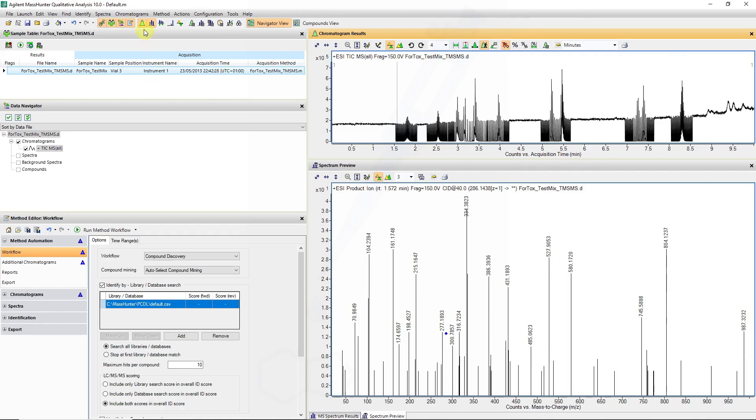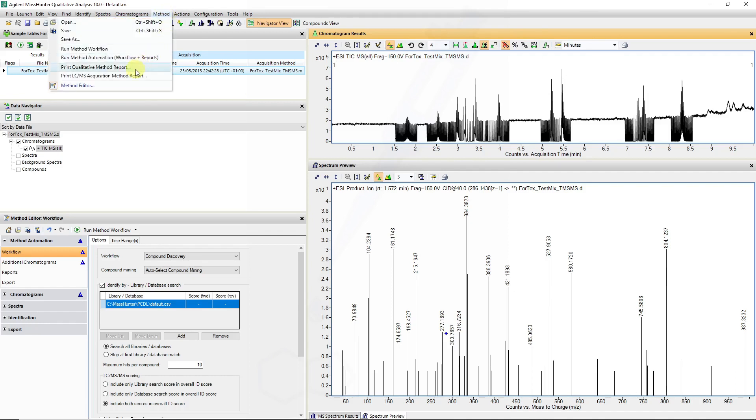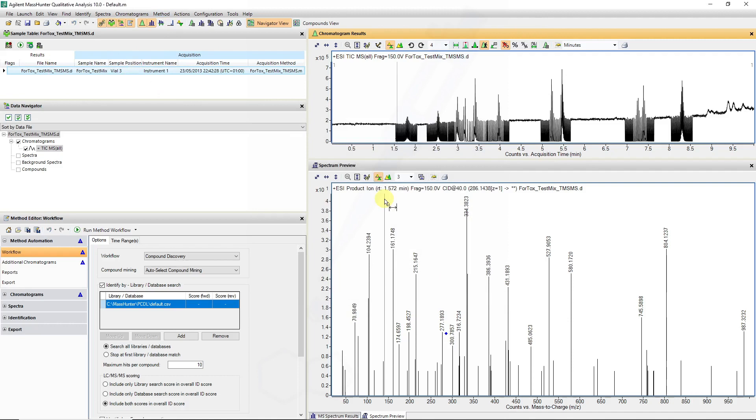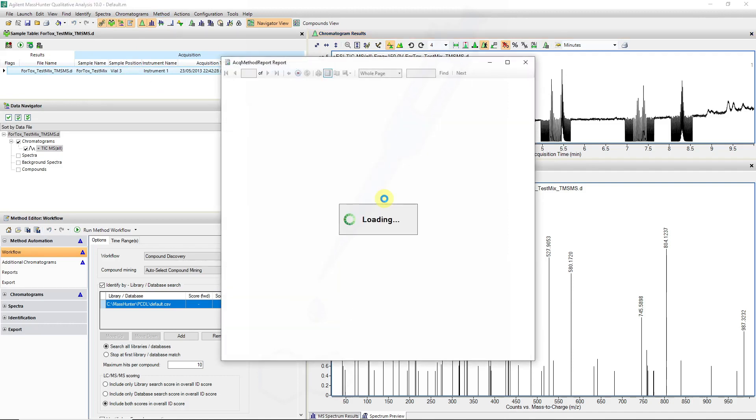So you can also verify the method if you go to method print acquisition report and if you print preview, you can see some of the target inclusion features and where certain features were added in the chromatogram for this particular method.